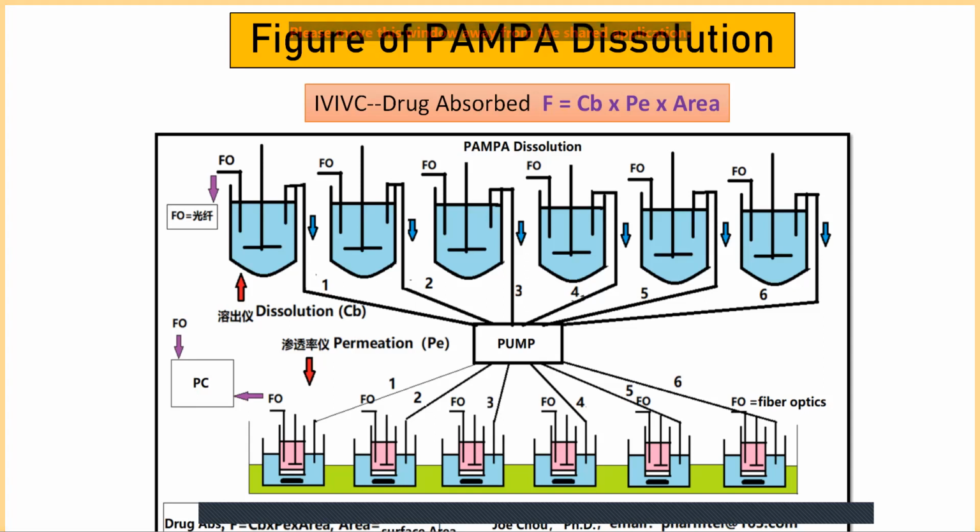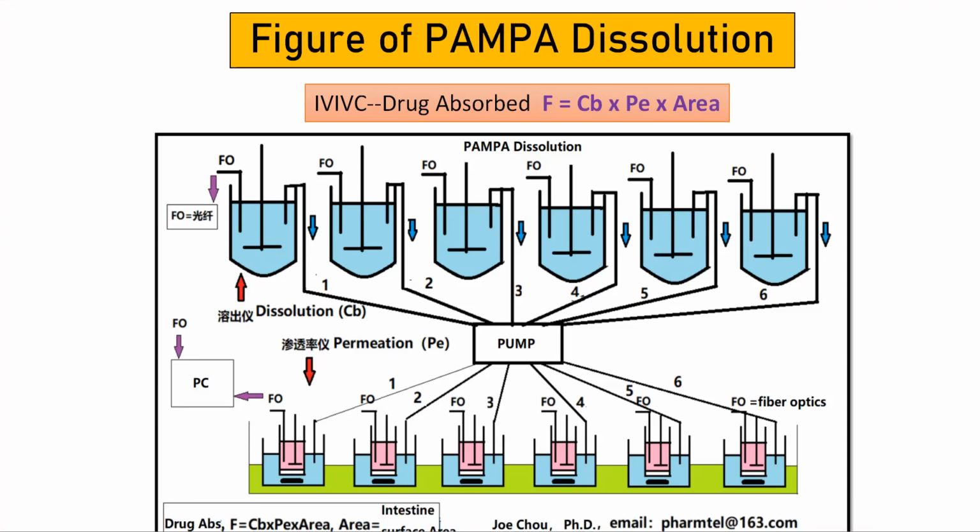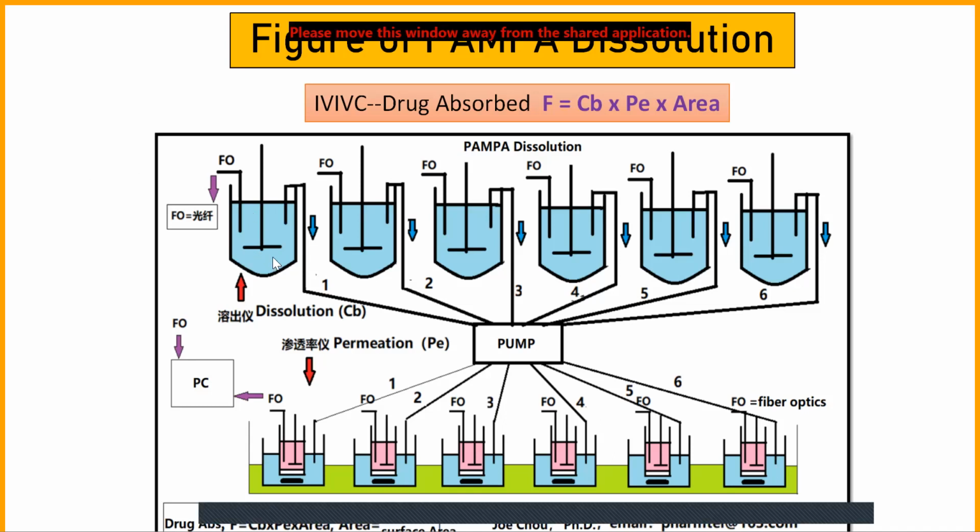However, the media composition is not buffer. We are using so-called biorelevant media to mimic the human GI tract composition. If you use buffer, you really deviate from the human GI media. So this biorelevant media is used in the vessel for dissolving the tablet or capsule.